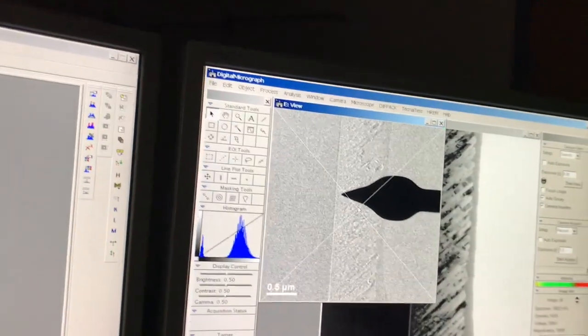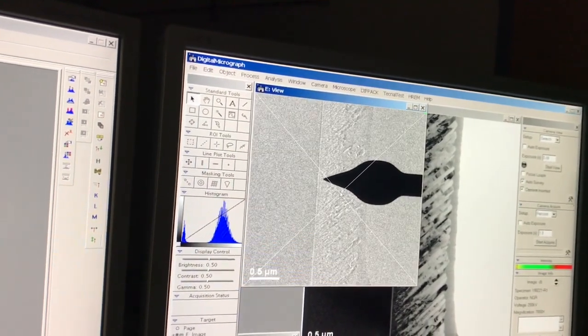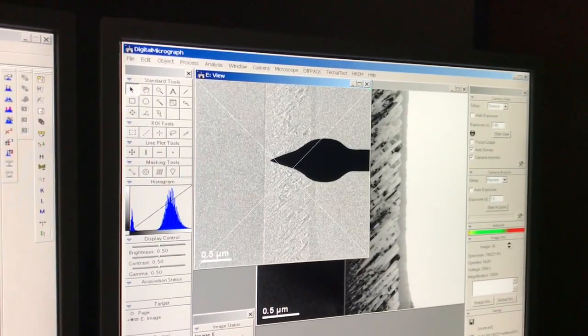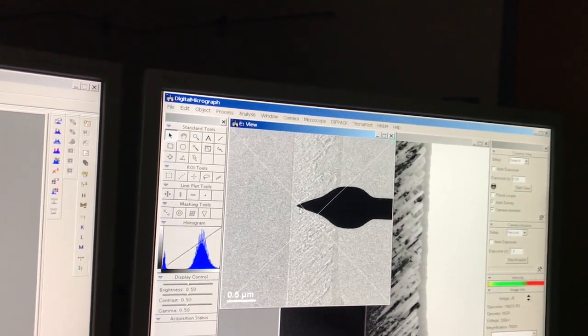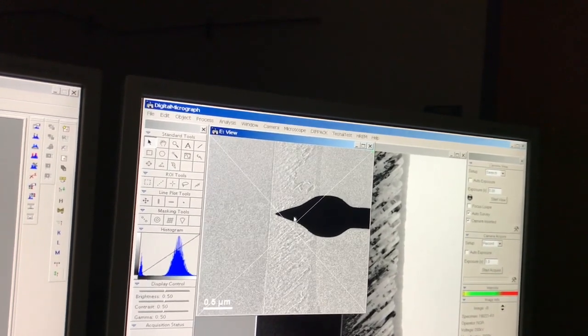Okay, so on this instrument here, it's a little hard to see, but this guy is the beam stop. Okay, so I turn this towards me, okay, and it pulls in. So that's what it looks like right there. Okay, it's got a point on it. There's different designs depending on the microscope, depending on who made it. So yours may not look like this, okay? But then I want to position this, the way I record these, I position this pointy thing right over here. Okay, not the tip, but somewhere in the middle. You want something substantially large right there.